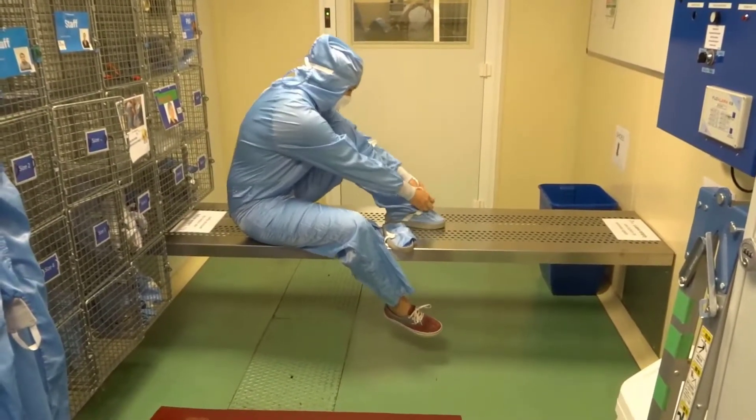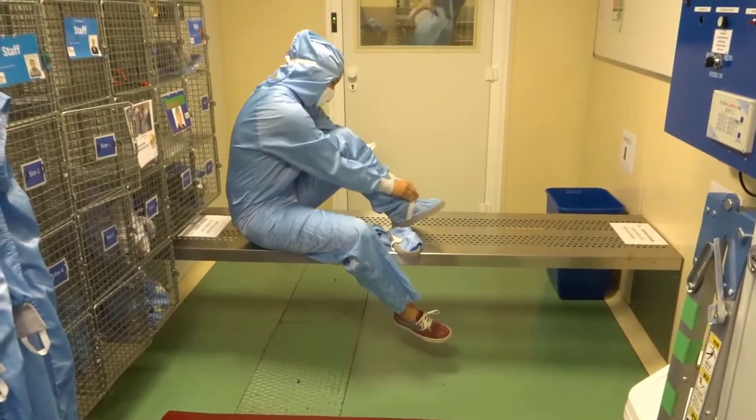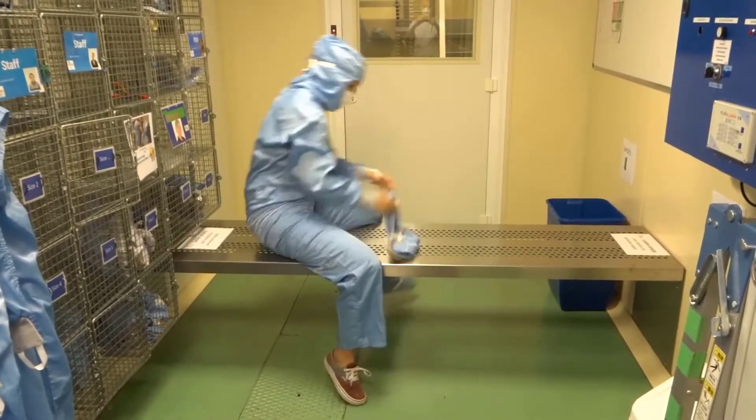Once an overshoe is correctly strapped, you can place your foot on the other side of the bench, which we call the clean side.